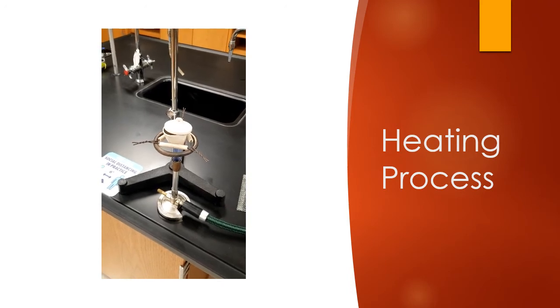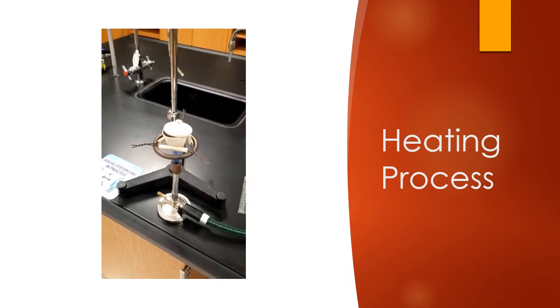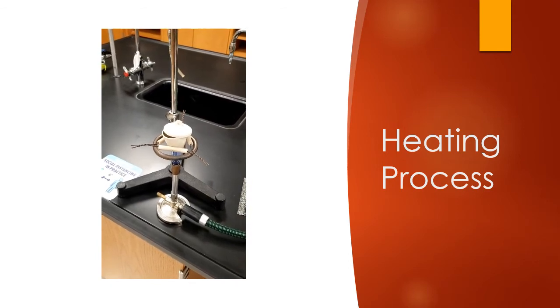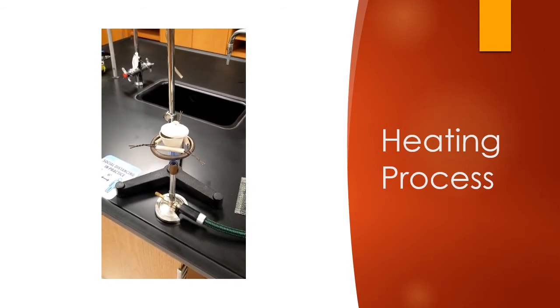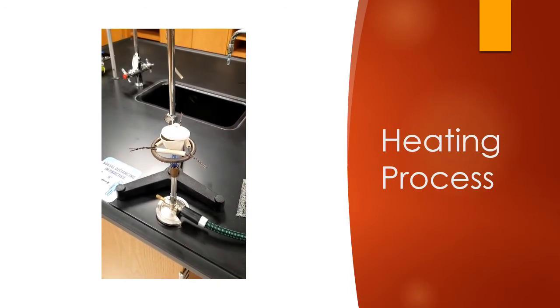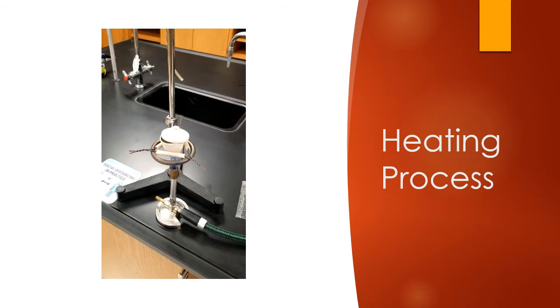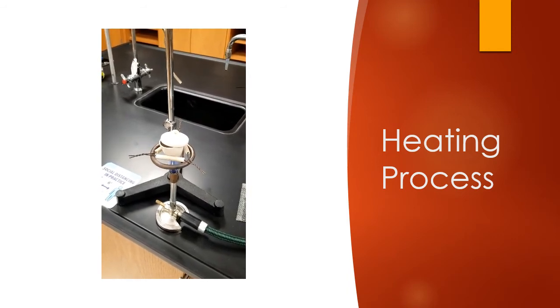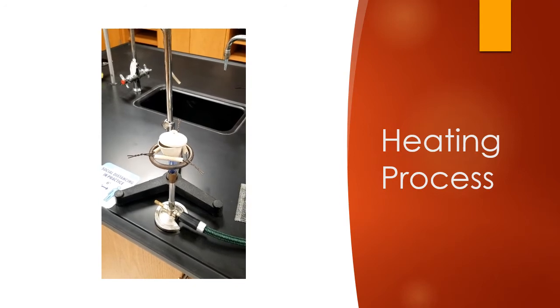When we're heating it this strongly, it's going to break those crystals apart, so there's going to be some popping. We don't want to lose any of that material, to get a more accurate mass at the end. So we put the crucible cover on, and any of the material trying to pop out will get stuck on the crucible cap. This is why when we massed the crucible when it was empty, we included the mass of the lid as well.